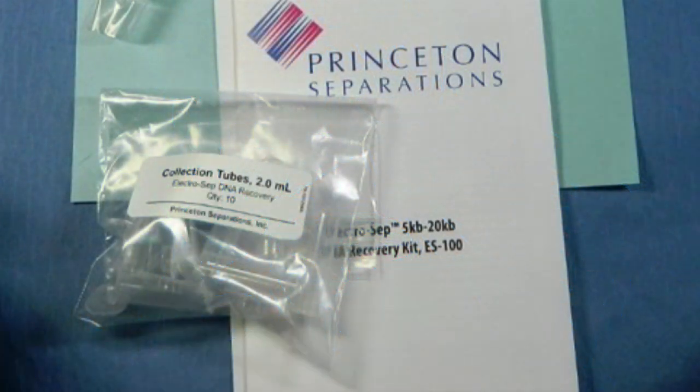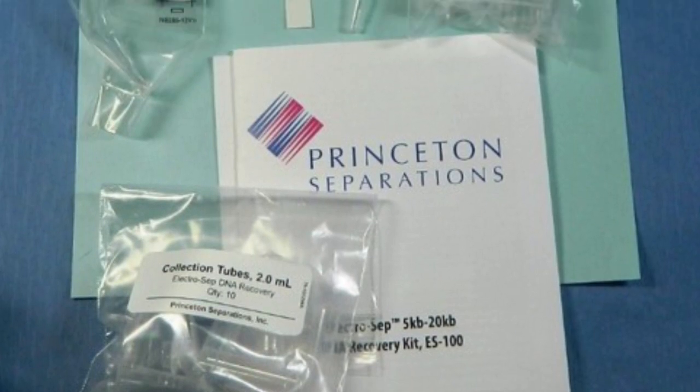ElectroCEP is a product used for size selection in an agarose gel without the need for ethidium bromide or cutting the gel. This video will go over the basic steps in using an ElectroCEP kit.